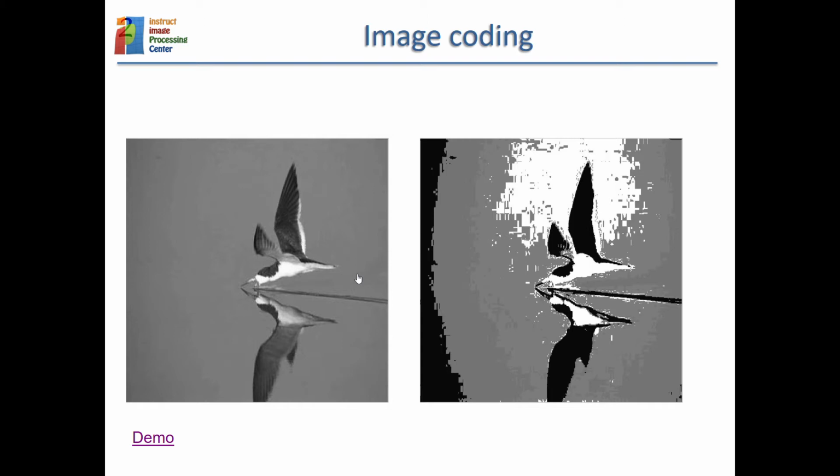When we collect images in the electron counting camera, each pixel is counting how many electrons have arrived during a particular period of time. So these frames that the camera is collecting, this number of electrons goes from 0, 1, 2, 3, and it depends on the time and the dose, but it rarely goes above 16, let's say, for a pixel.